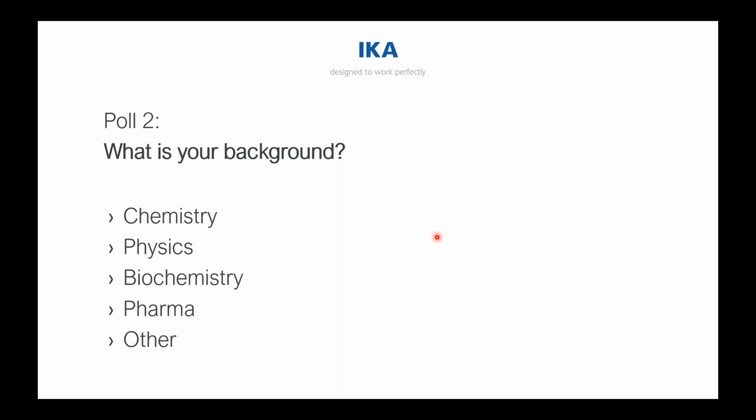It's really interesting, because these rotary evaporators can be used in so many different applications, but I also think the main application will be the chemistry sector, where you have solvent recovery, where you can just get rid of your solvent after a reaction. So I also thought that chemistry would be the main background.